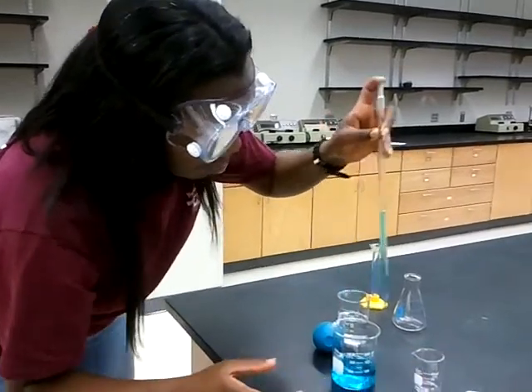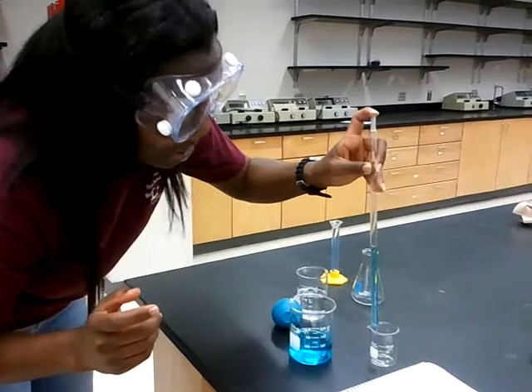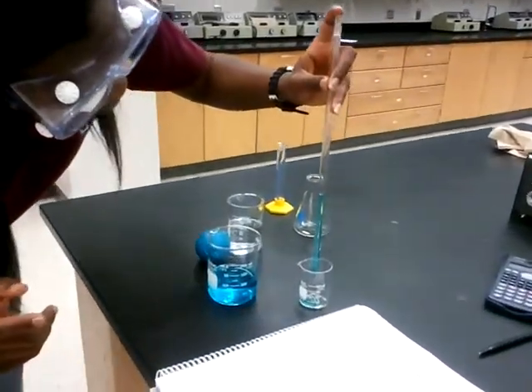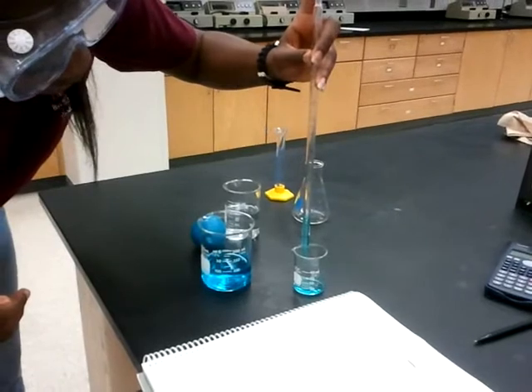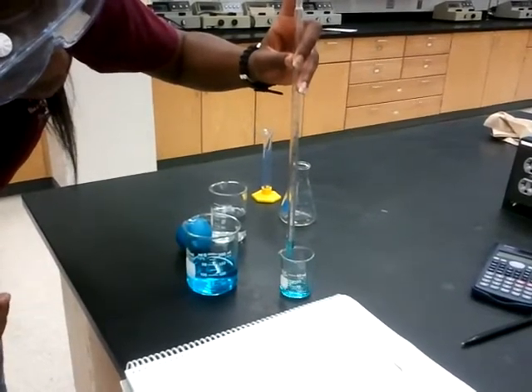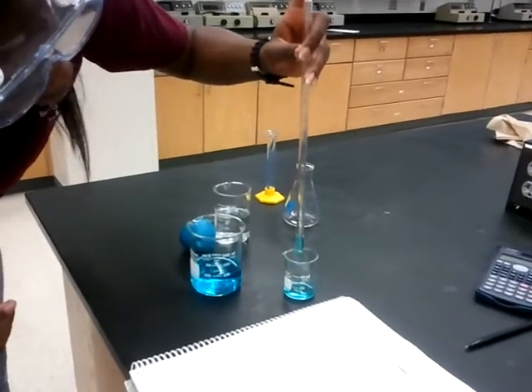And then we'll take that into our receiving vessel. We'll be sure to stop at 100, which will be your 10 mark since we're measuring 10 milliliters.